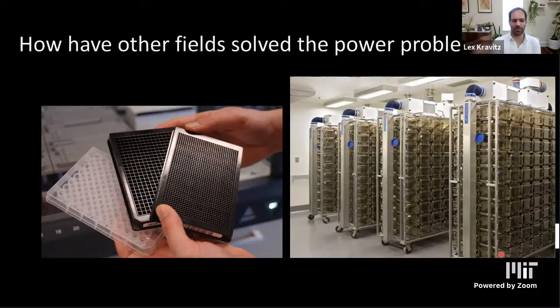You don't have to worry about moving them from their cage to another environment, possibly taking an elevator to another floor, all these things that can impact the final results. So just leaving them in the colony and letting them go for a week or two is, in my vision, a much preferred way to go.